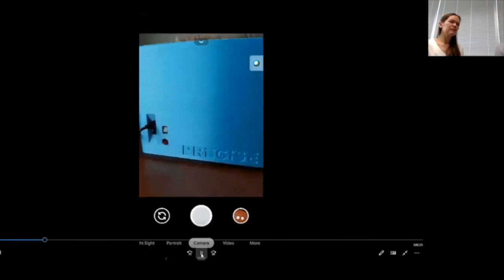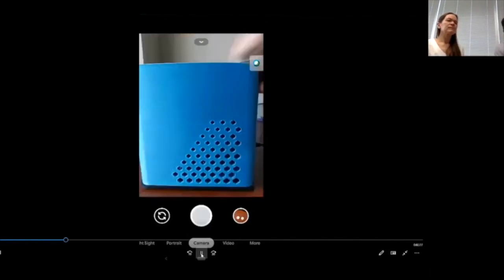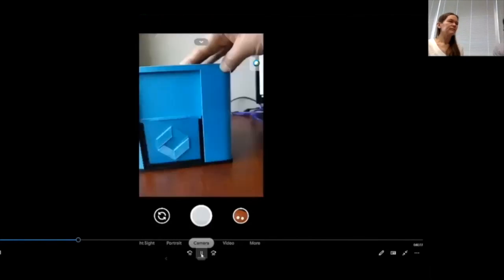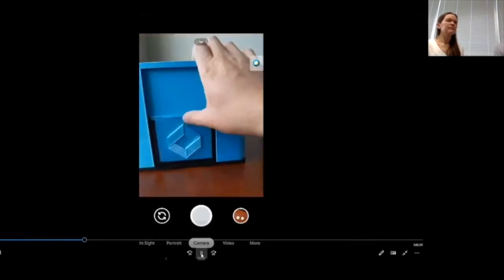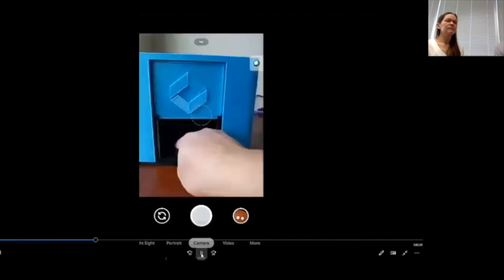And this is the back of the box. You can see one is a switch, and the other one is the red button to do the pairing for Bluetooth. And on this side, you can see we're using a microcomputer. Here we need to deal with the heat. And this is a sliding door over here. You can slide it up and see the compartments inside of it.